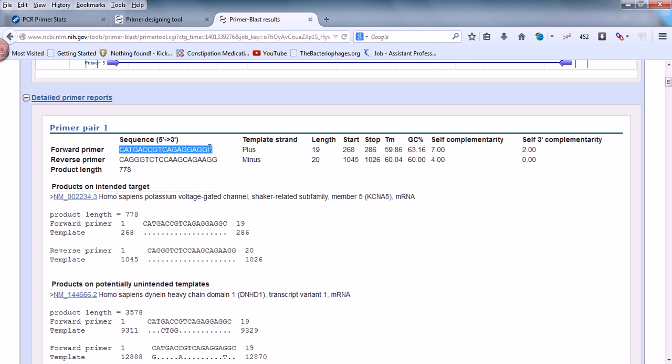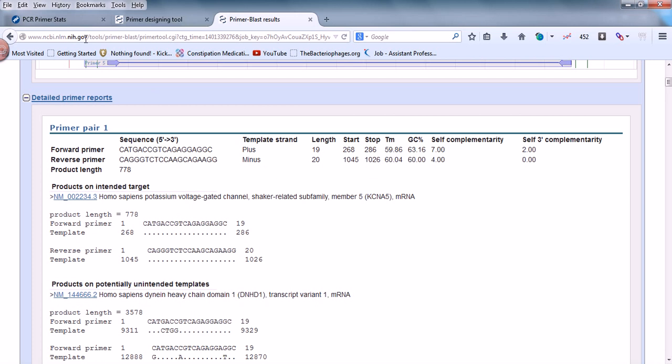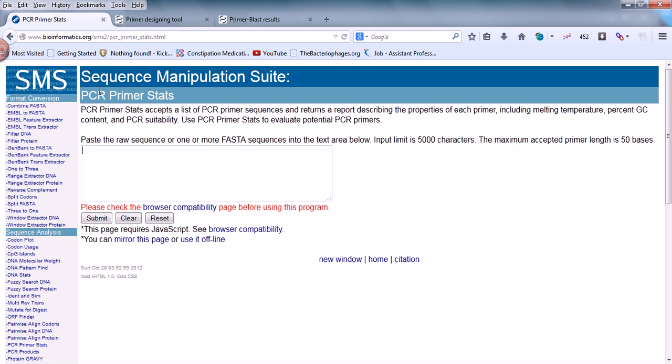Let's select primer pair number one and the forward primer. You need to check whether it's going to be compatible with our experimental status, whether it's going to be good in assays and in vitro conditions, and whether it forms any dimers. Primer self-dimer formation can be dangerous for experimental status. Let's go to primer stats and visualize it using software called SMS or Sequence Manipulation Suite. You can find this at www.bioinformatics.org/sms2.